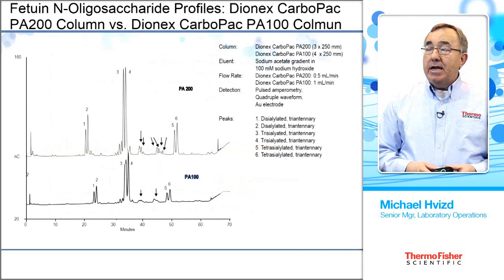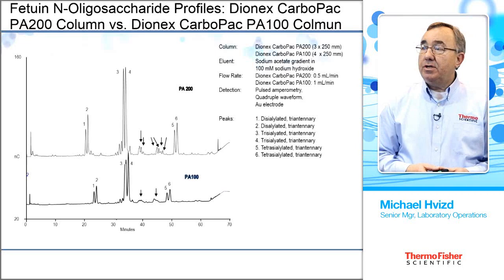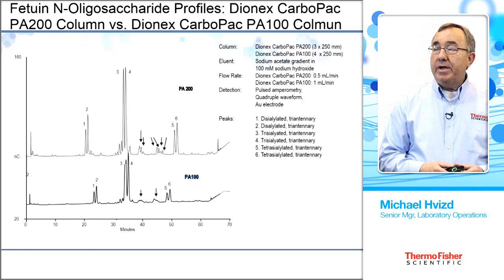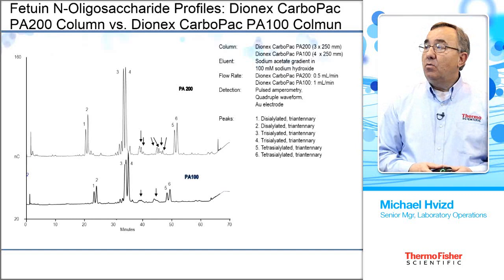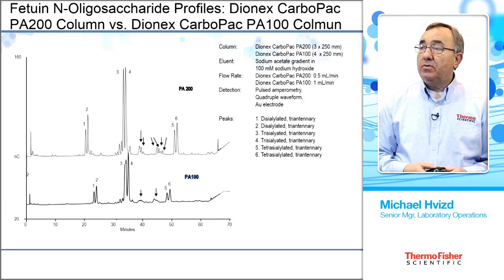Here again is an illustration comparing the PA100 to the PA200. Notice where I have arrows on the two chromatograms. On the PA100, we can see there's definitely some material there, but it's not very well resolved. Whereas on the PA200, we get very distinct and sharp peaks — the resolution is much improved because of the smaller particle size on the PA200.